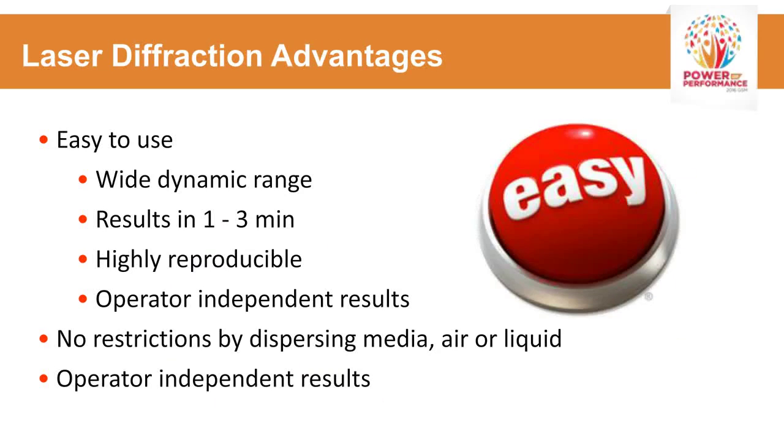Now, the advantages of laser diffraction are multi-fold. These instruments are quite easy to use. They cover a broad dynamic range, in other words, from submicron particles to usually multiple millimeters, so a couple of thousand microns down to below a micron. They can do this quite fast. Typically, results can be in 1 to 3 minutes, thereabouts. Could be a little longer depending on if running liquid systems.